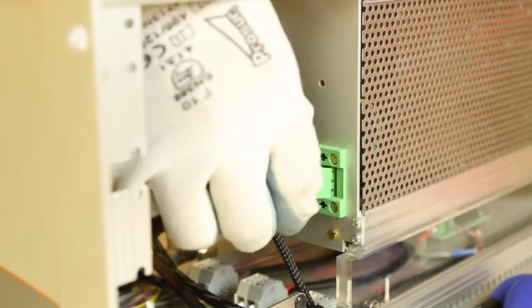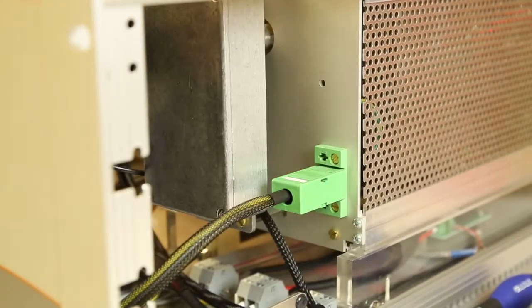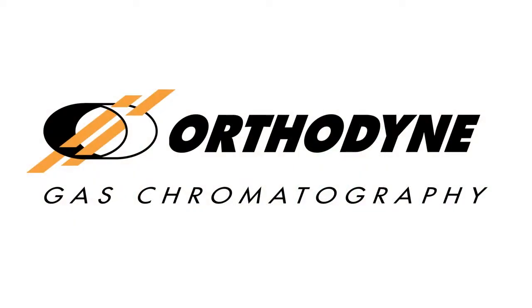Reconnect the power supply. If you have an FID analyzer, restart the flame. Your module is again ready for operation.